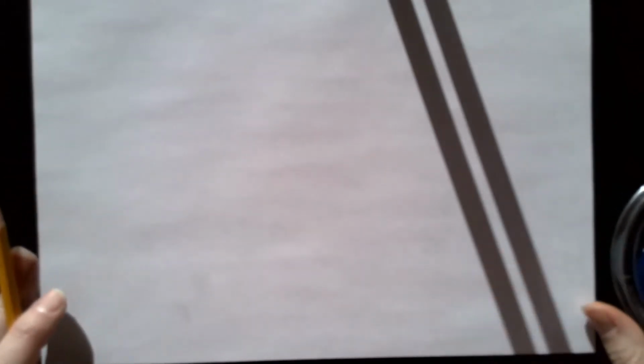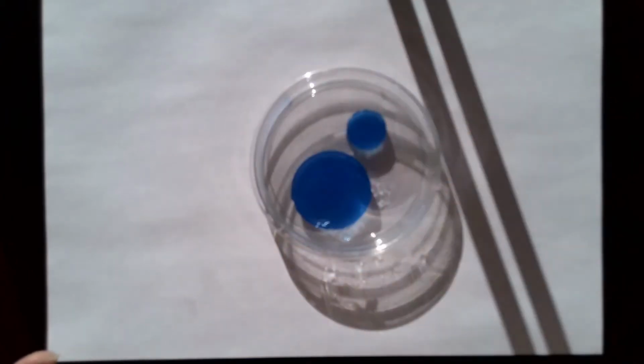Hey everybody, this is Miss Aninga coming to you to help you out with your importance of shapes and size of cells lab for biology. So today I'm going to set up the first part of the lab, which is looking at the importance of size to your cells.